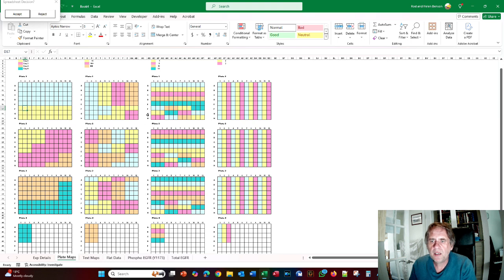So what do I mean by that? Well, you can see that if you look at this compound here, this is compound 2. So compound 1 fits nicely across here. Compound 2 would fit nicely if it only had 3 rather than 5 time points. So if we knock out the 0 and the 30-minute time point, then it would fit in this little space here. And that would just fit nicely for compound 2.